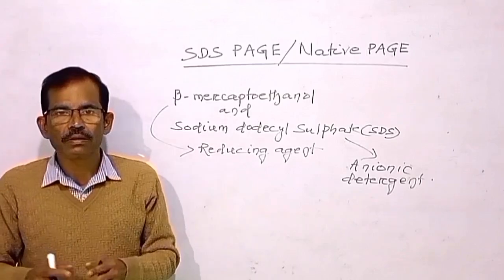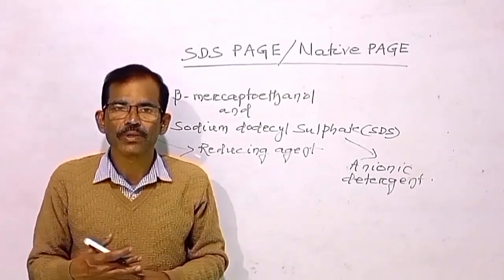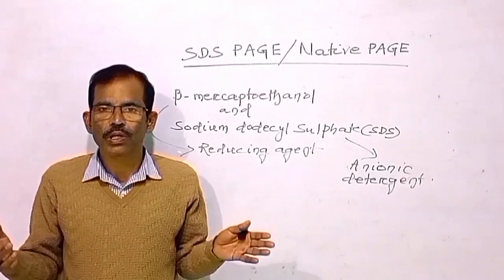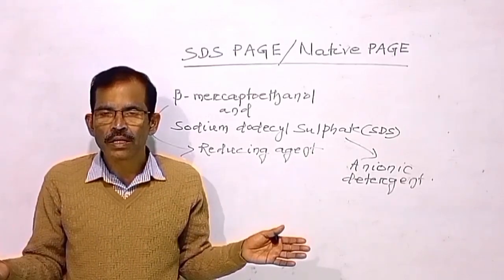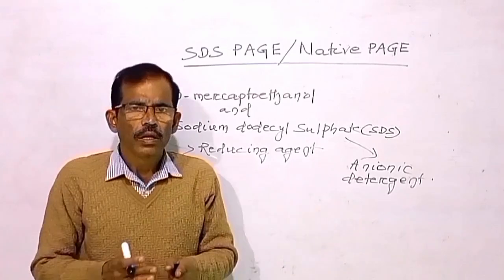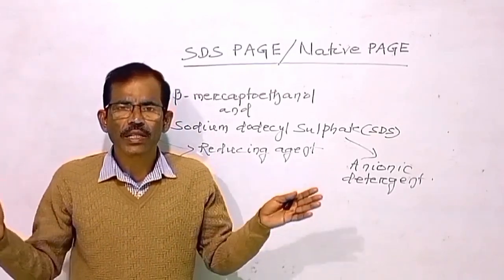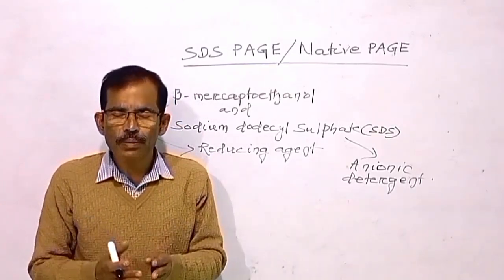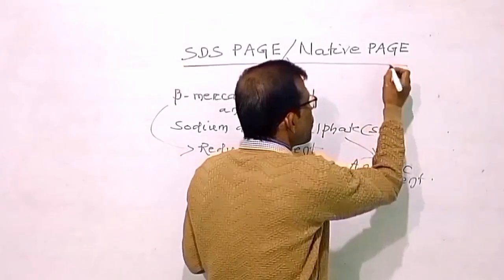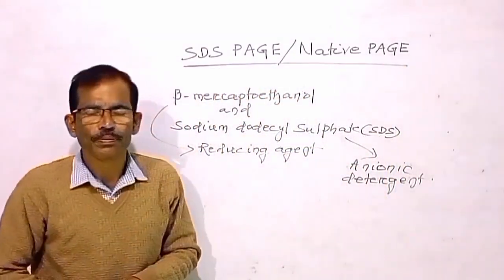Sometimes, particularly in case of enzymes, it is necessary to separate these proteins while retaining their native structure and function. To achieve this, another technique called native polyacrylamide gel electrophoresis, native PAGE, has been introduced.